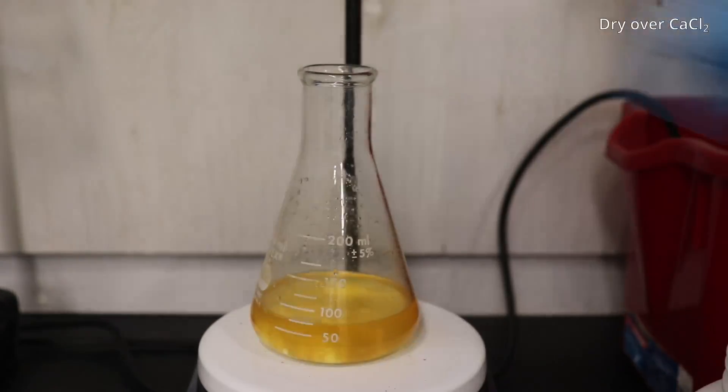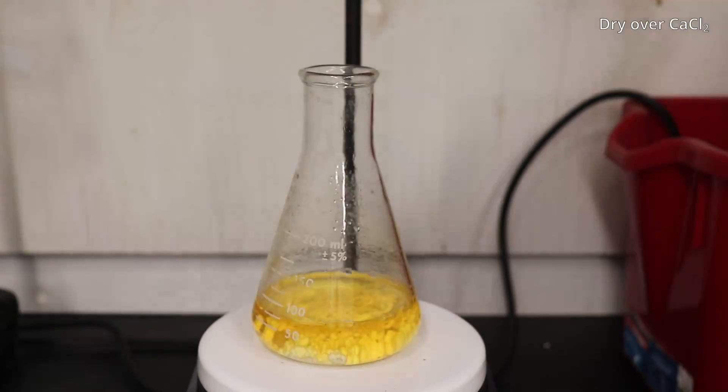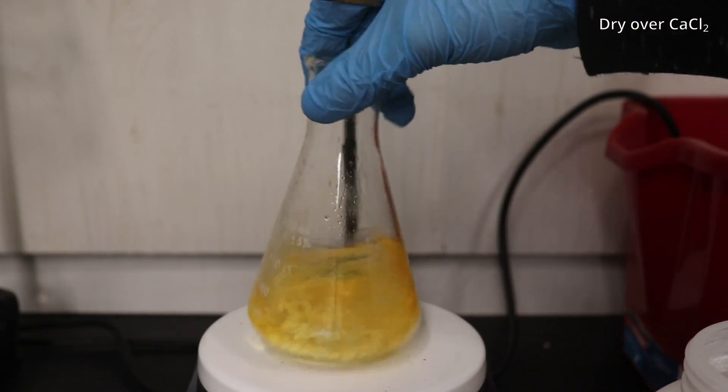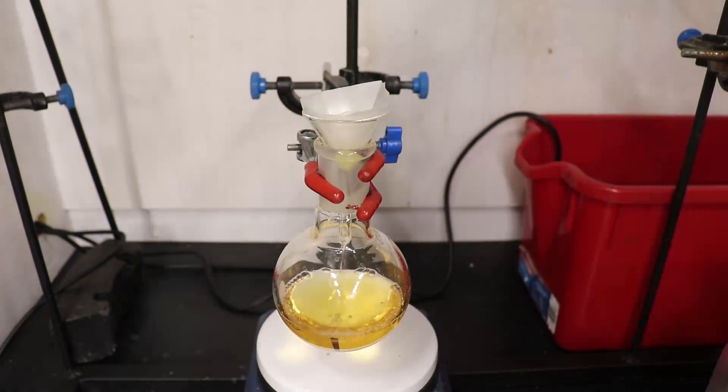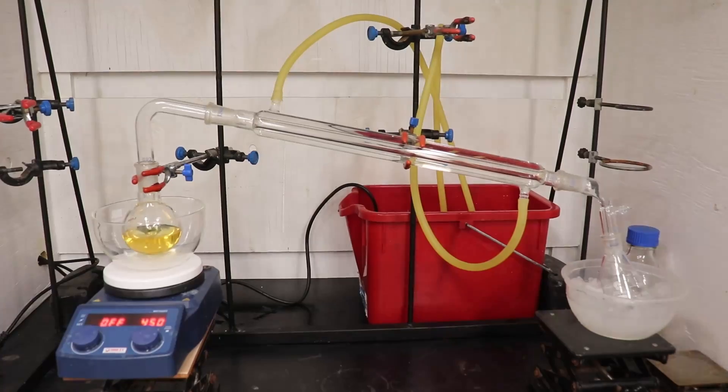The organic phase was drained off into an Erlenmeyer flask and then dried over anhydrous calcium chloride for about one hour. The solution was then decanted off and filtered, and then the ether was removed by simple distillation.